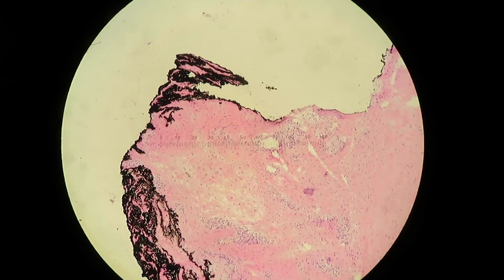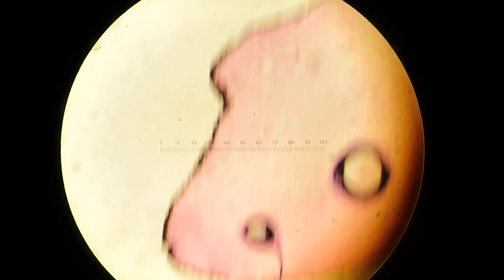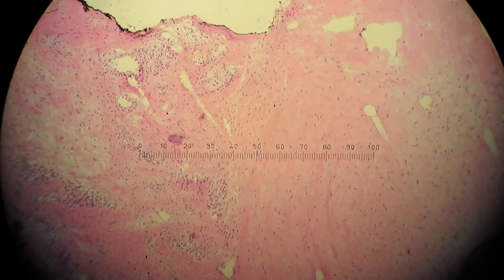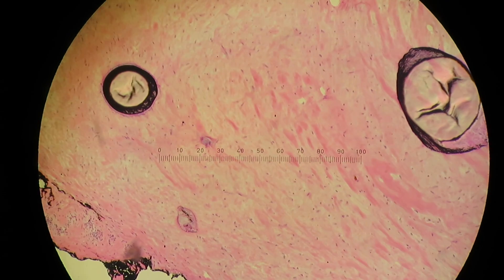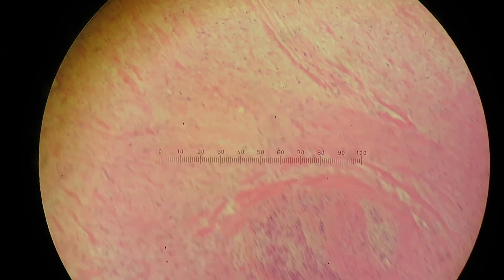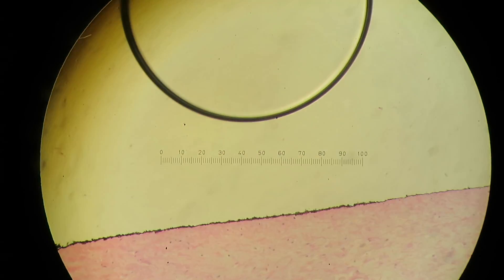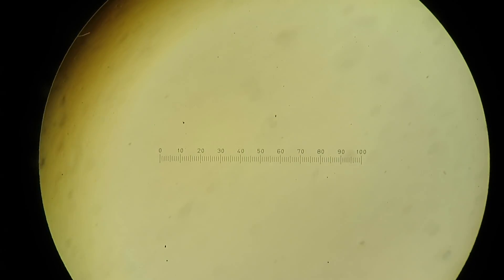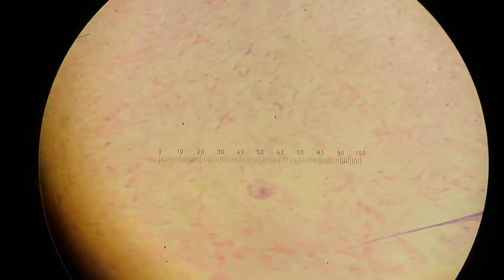We're scanning it right now. It's a lot of fibrous tissue — pretty bland-looking fibrous tissue. 'Bland' is our code for just benign-looking. Was there anything on the gross that looked more colored, more pink or something?